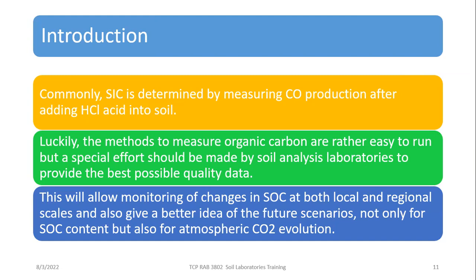The other method is normally known as wet digestion, and actually the Walkley and Black method belongs to wet digestion, in which you combust the organic matter by using sulfuric acid.